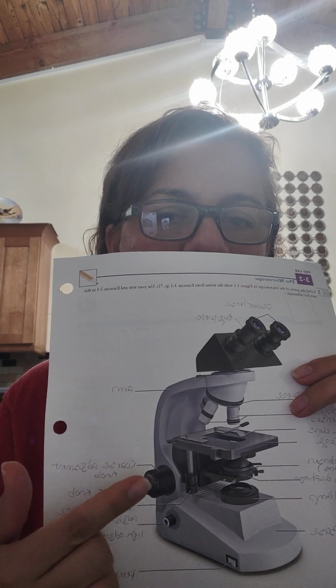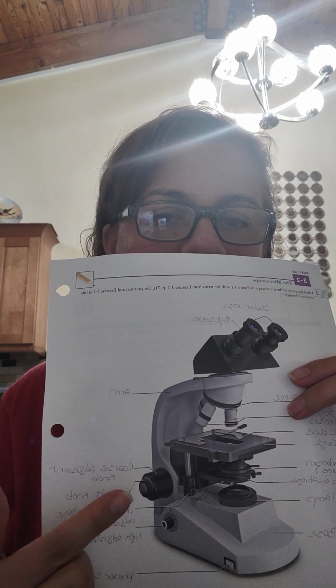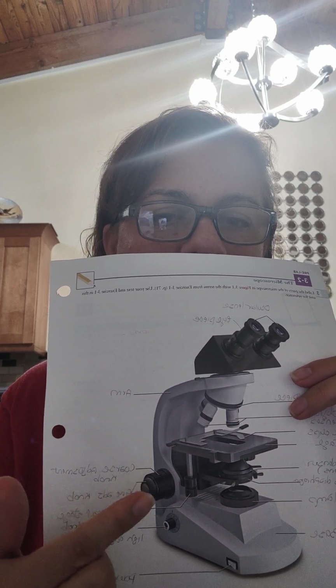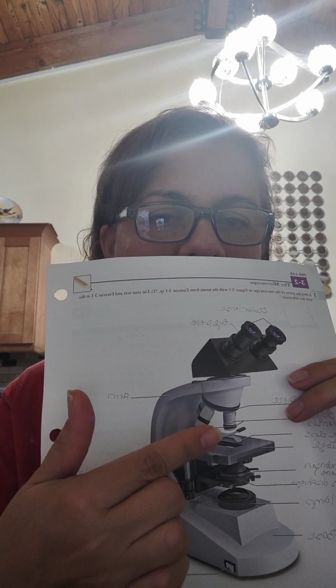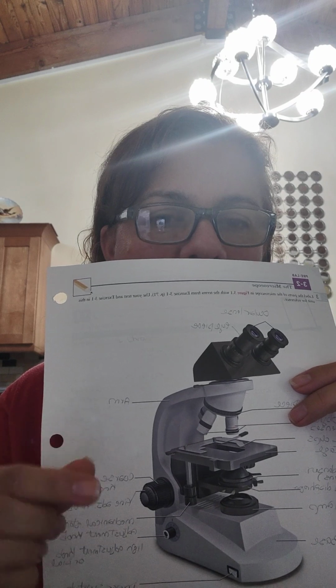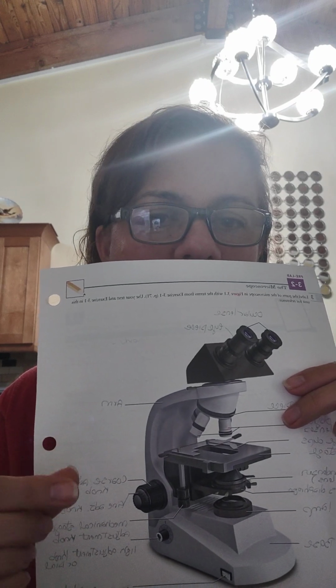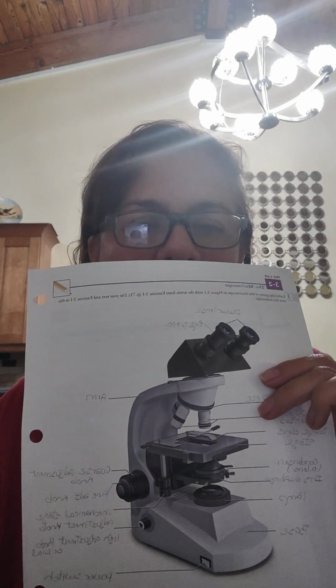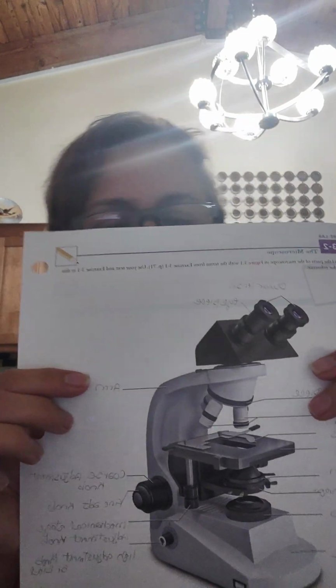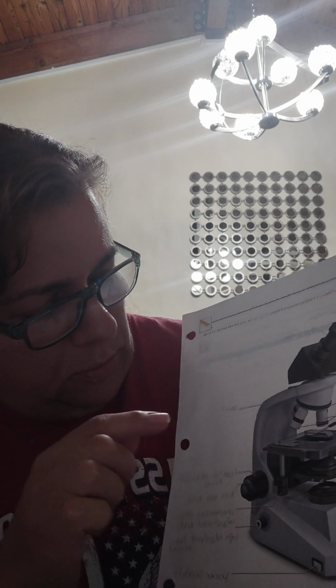The fine adjustment knob, which in this microscope is right in the middle of it, this is because once you find the specimen, now you're going to close in on it and you're going to focus. You're going to find focus to see the detail. So that's number 3.